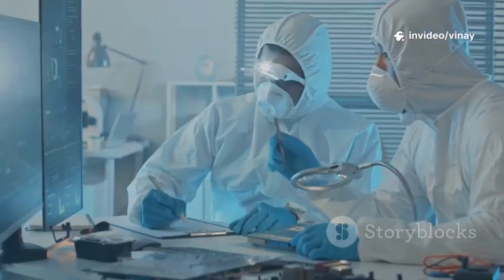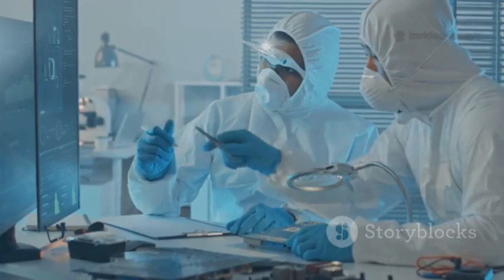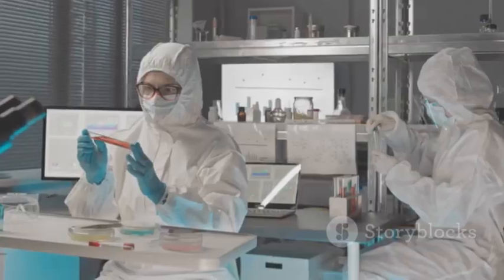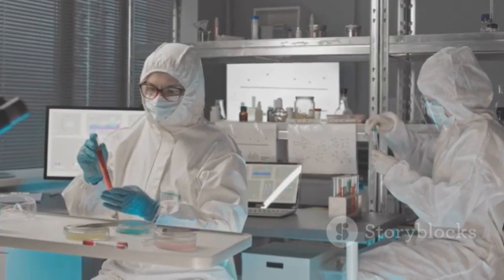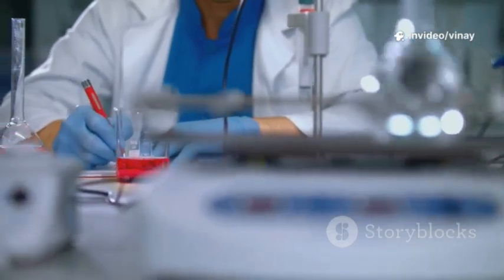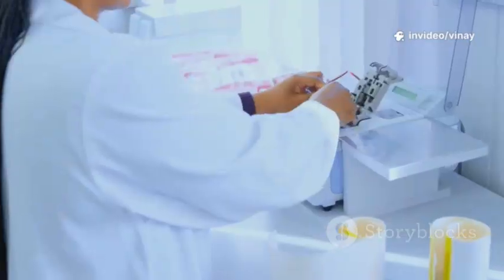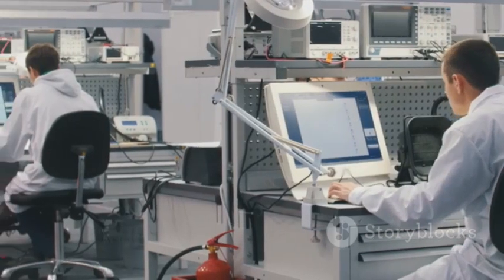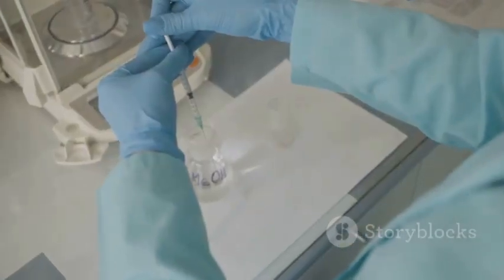This is a critical control point in pharmaceutical manufacturing, and honestly, patient safety is always the number one priority. The batch is quarantined, and the science detectives get to work. The investigation process is a systematic search for the cause of the failure. The first step is often to check the test setup itself. Was the test performed correctly? Was the filter wetted properly?